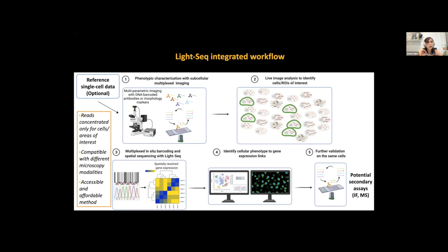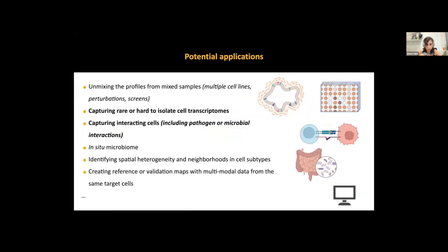One limitation, of course, is that things are a bit more on the 2D level, because in 3D, it's hard to pinpoint the exact location without having light exposure at the bottom or top plate layers. But in 2D samples, at the level of 10 to 20 microns, it would be really applicable. And the approach is quite accessible and affordable for people to do in their labs, just using maybe a scanner or a DMD on top of an existing microscope.